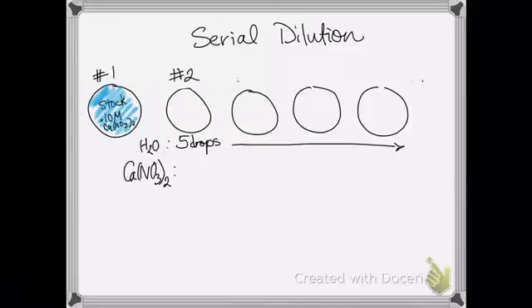In the procedure, they have you doing something called a serial dilution. I thought it might be helpful to explain what a serial dilution is before you step into the lab next class. It's a pretty easy concept. You're just continually doing a dilution over and over again. But I just want to confirm the math with you.